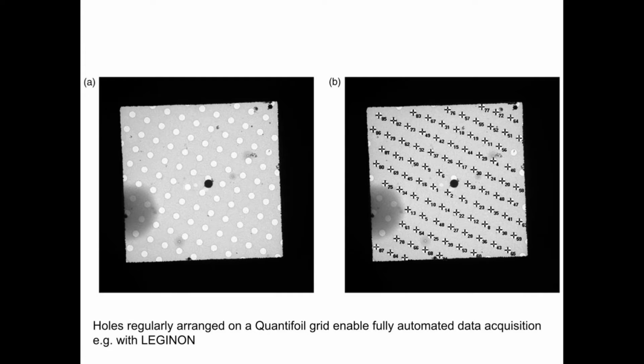They use the average density and the standard deviation in a 2D diagram to determine whether this could be useful or not.